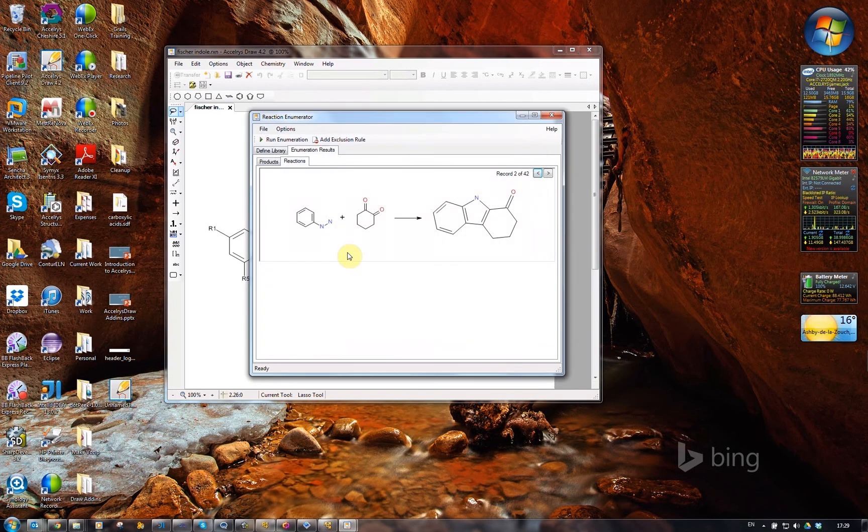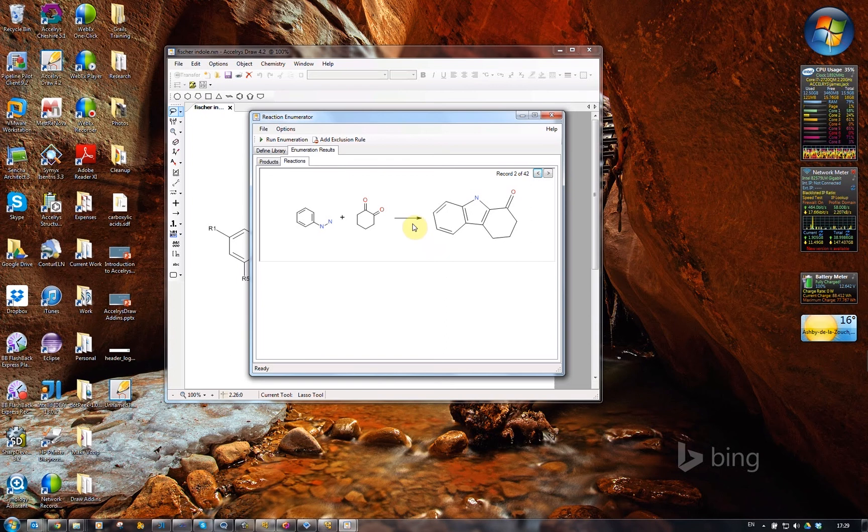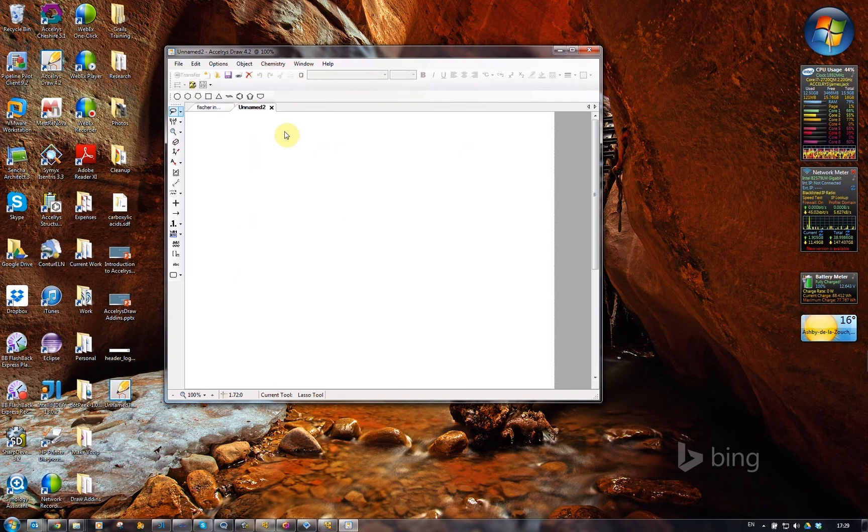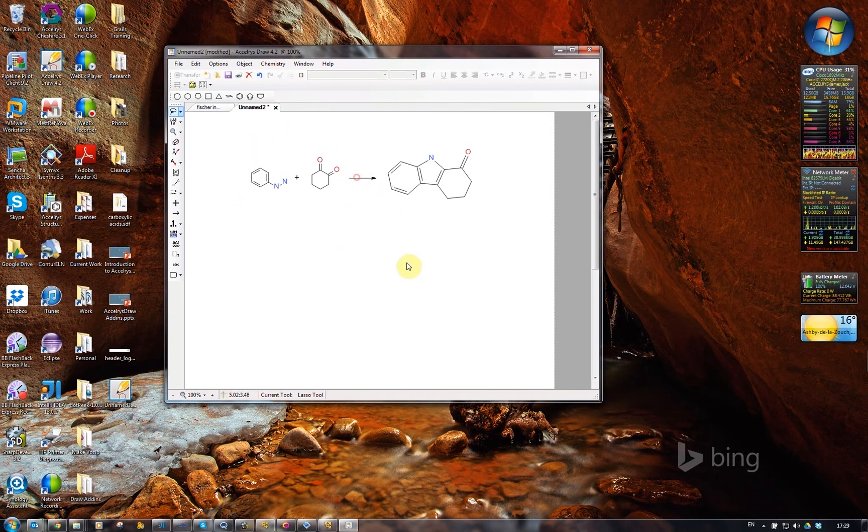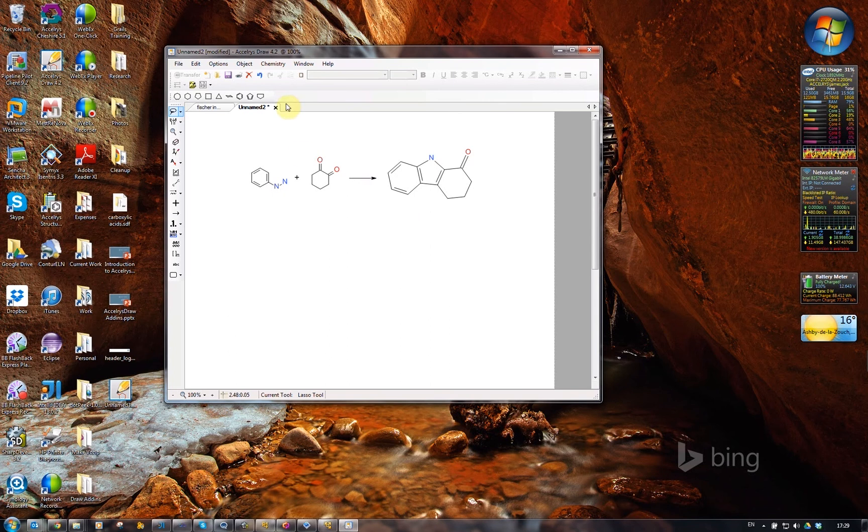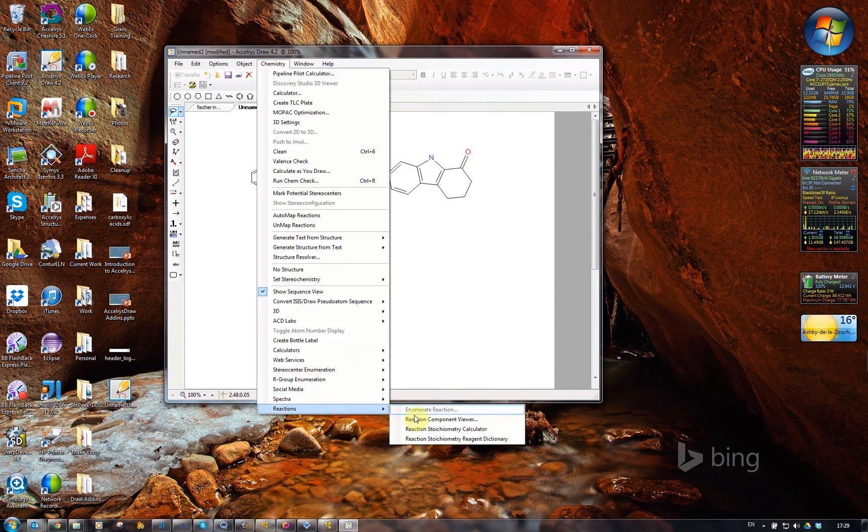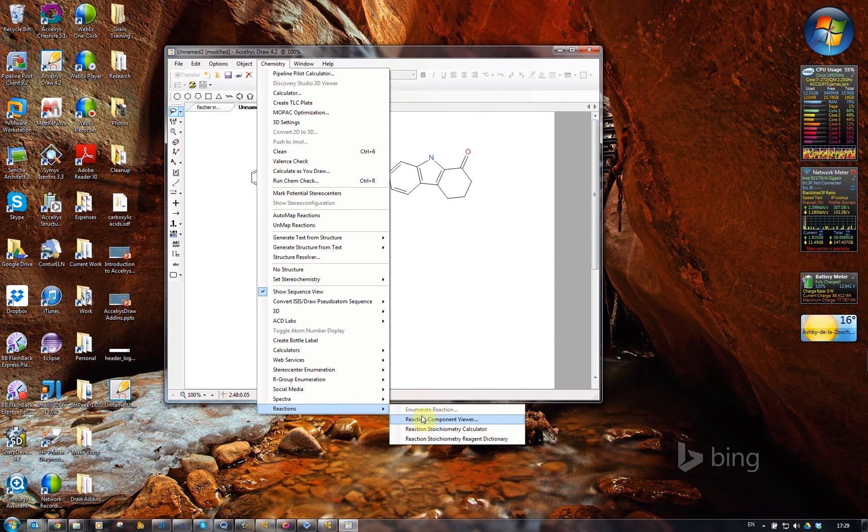So that's how the reaction enumerator works. For the next step, I'm going to copy this reaction and close this dialog, create a new tab, and paste that reaction in. Let's use the reaction component viewer next.